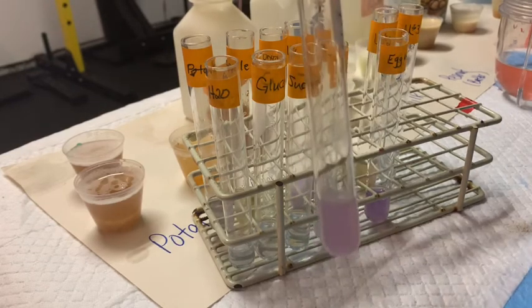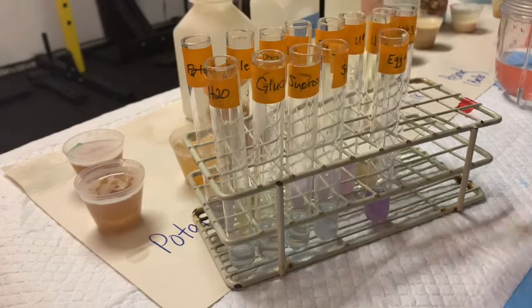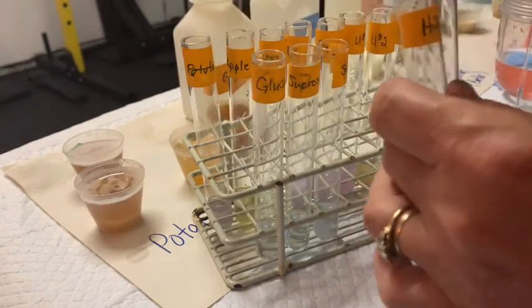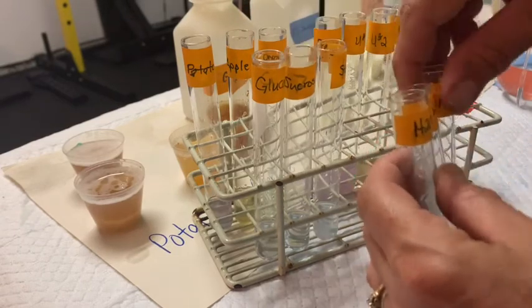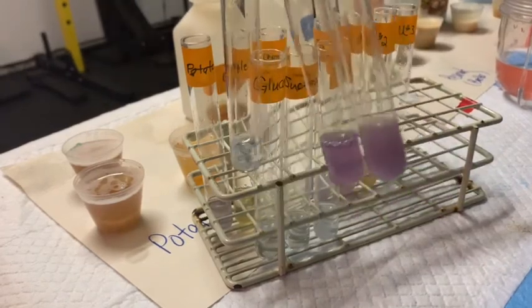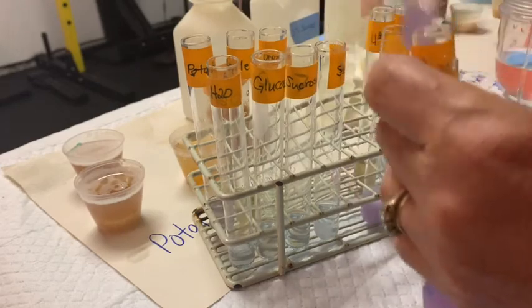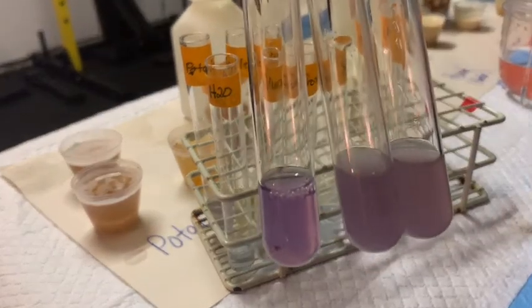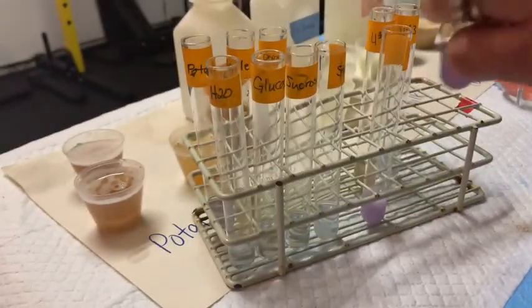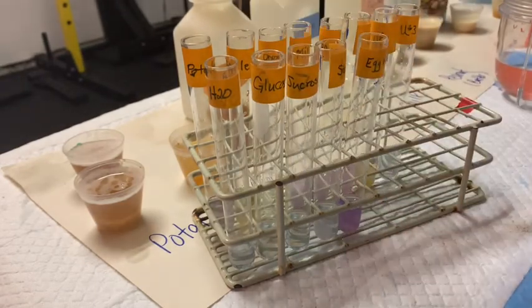Unknown number one looks just like the milk and egg whites. Unknown two and unknown three — let's go back and compare water, egg whites, and milk. Our egg whites is our positive control, and you can see that the milk basically shares the same color. Peanut butter and unknown number one also have the same color — so these are going to be positive results for protein. The more purple the color, the more protein you have; the more purple it turns, the more peptide bonds between amino acids you have. These results will be presented virtually on Canvas, but I wanted you to see what they look like.